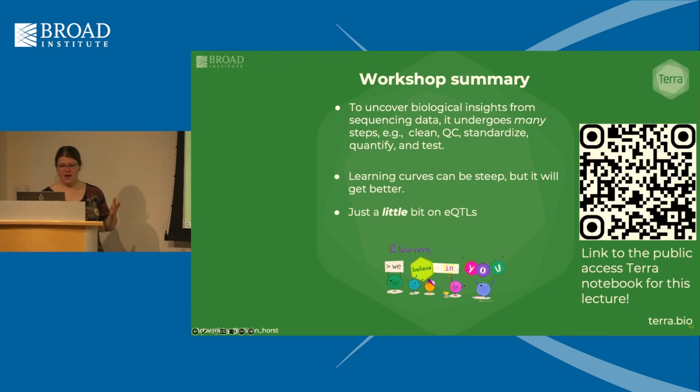So that's what I've got. I know that was really fast. The goal here is to uncover biological insights from sequencing data. You have to go through so many steps to get there. You've got to actually get the data. You have to actually do all the stuff in the lab, right? We didn't even talk about any of that hardly at all. And then you've got to sequence it, and then you've got to analyze it. And so that's a lot.